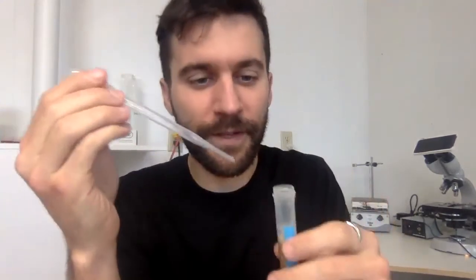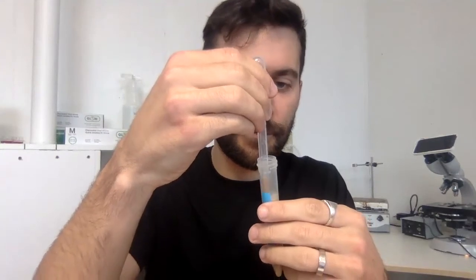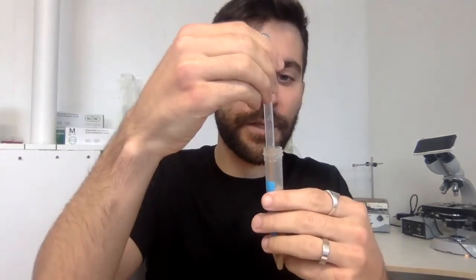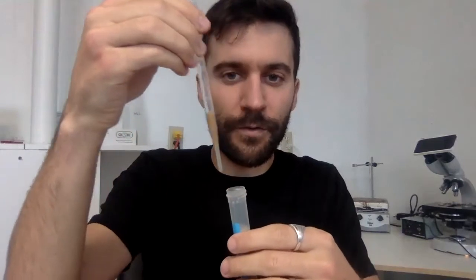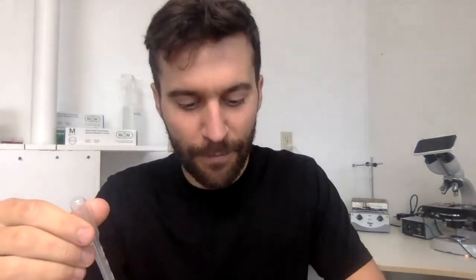Okay, so take a milliliter of this. By the way, I'm using these crappy plastic pipettes here. They're accurate, we'll find out, but I'm just using these for now.